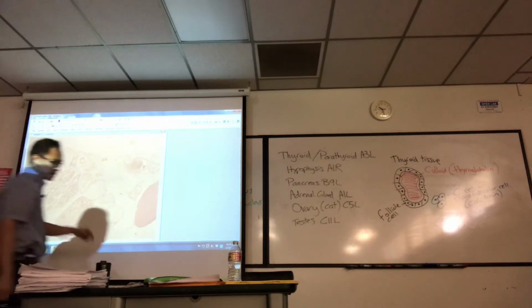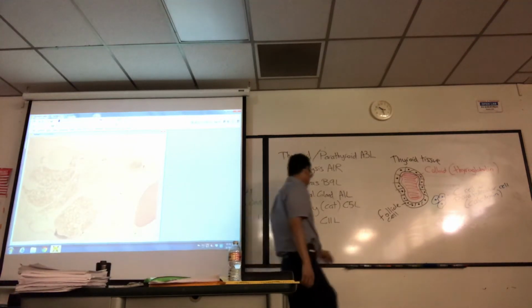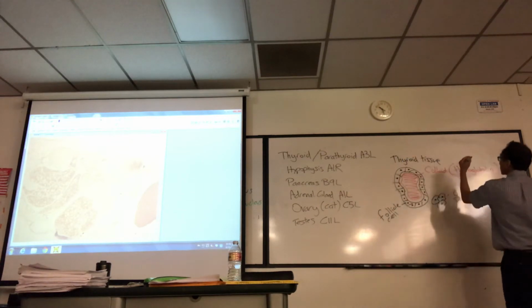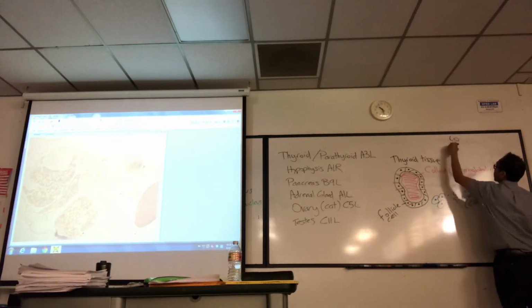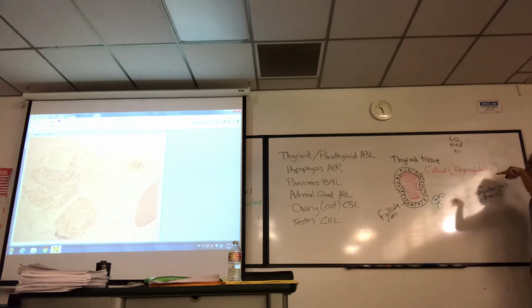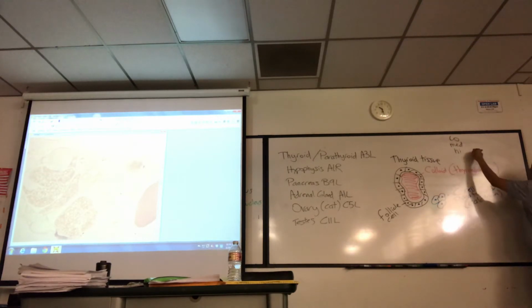I know it's hard to see with the lights off. I'll turn them on periodically, but when I use a microscope, I use 3 magnifications, low, medium, high. There's a higher one, but don't go past my high, which is 400x. You get to 400x, you can see cells. Our medium magnification will be 100x. Low mag, what you see there, 40 times magnified.